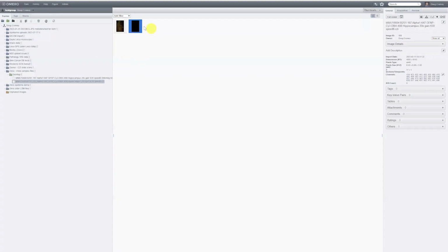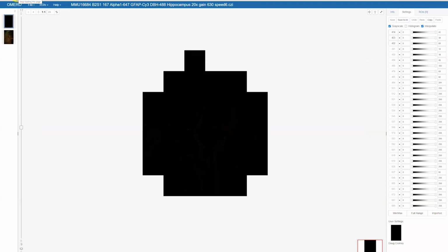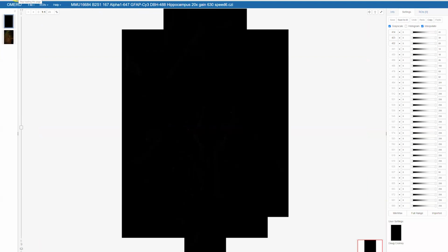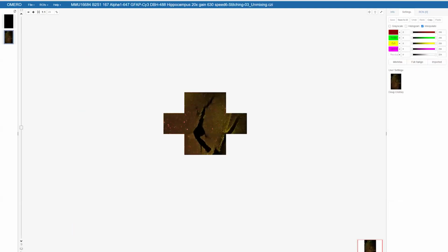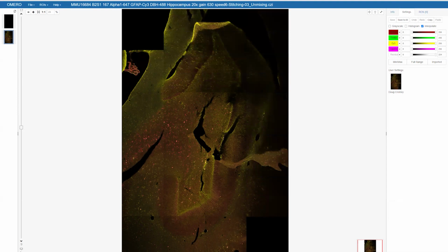So now I'm going to show you something that's kind of interesting. This is a very complex image that came from the Zeiss confocal on main campus. So I'm going to open this image data set. You can see over on the right, this was using the spectral detector on the Zeiss, and this is raw data, so it gives us the individual channels for the entire spectral range of that detector. Not all that interesting, but let's look at it unmixed. So this is the unmixed data. This is where they process it so that the autofluorescence is removed.